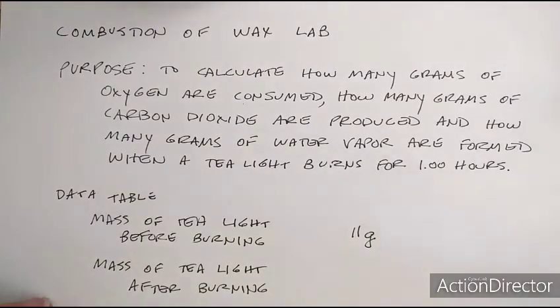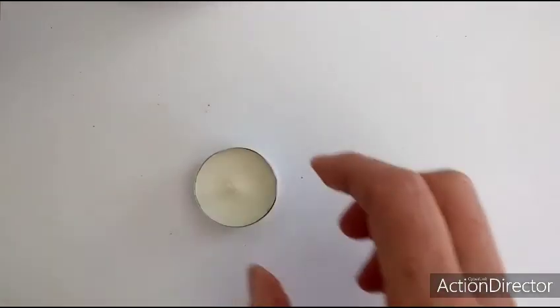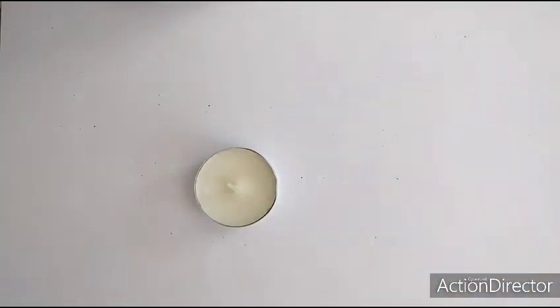Okay, so let's get our tea light there. Oh my gosh, I was going to use the timer on my phone, but my phone's already being used to film the video, so I guess we won't do that. Okay, so I'll just have to keep the time. So I light my butane lighter, which, oh, there we go. Okay.